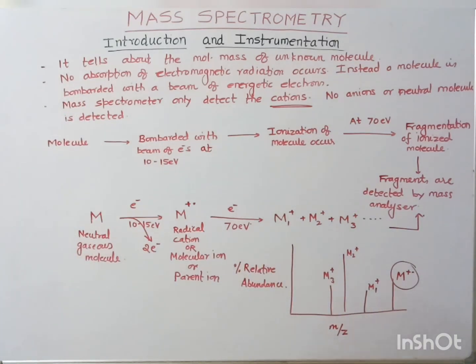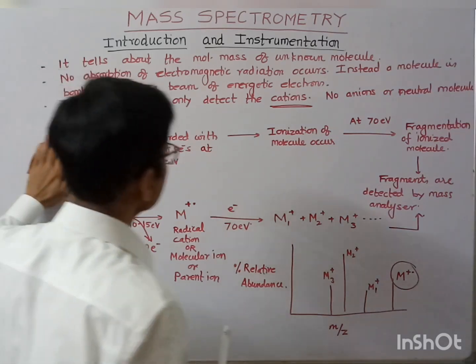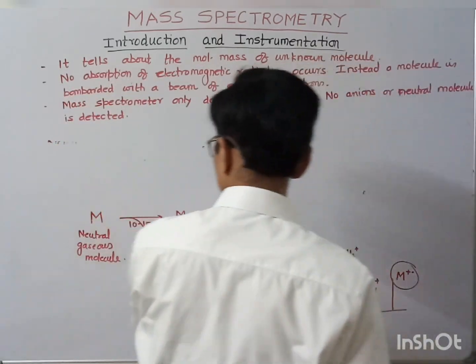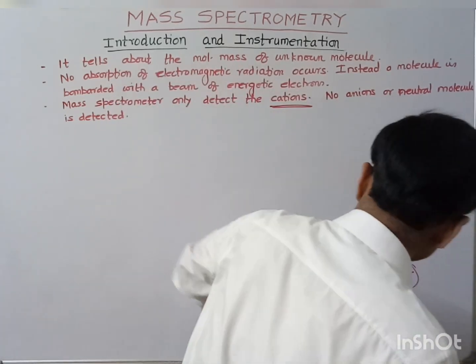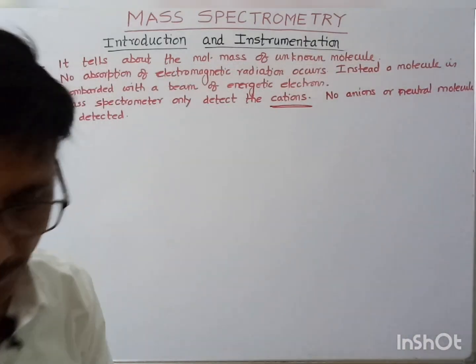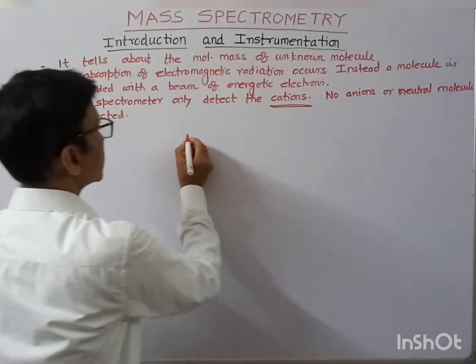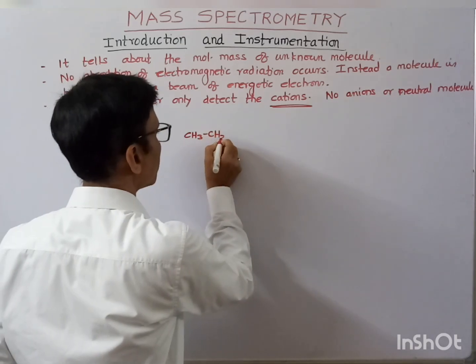Let us take one example. Suppose I fragment one molecule, and I take the example of hexane.